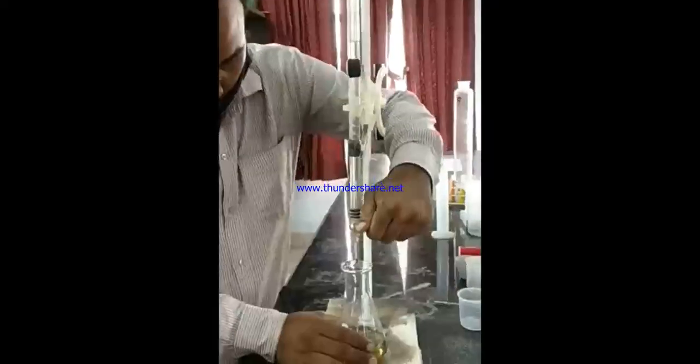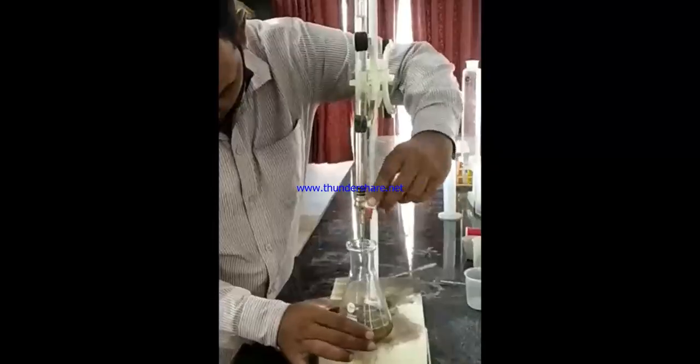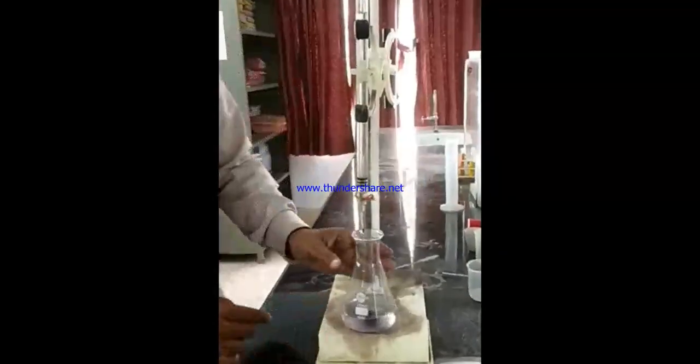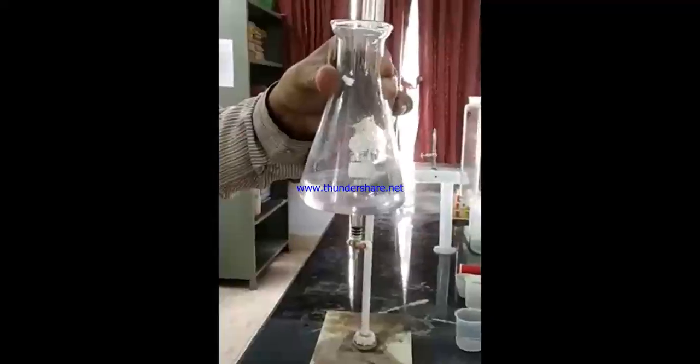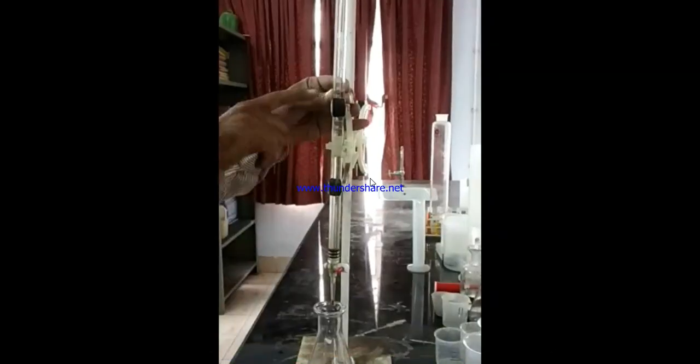Now the initial level of sodium thiosulfate we should note down. Then we will start the titration process and we will give mild movements to the flask. Okay. See, the titration started, we are giving mild rotations. See, colorless, it has turned colorless within a few drops after having mixed. We will note down the final volume.